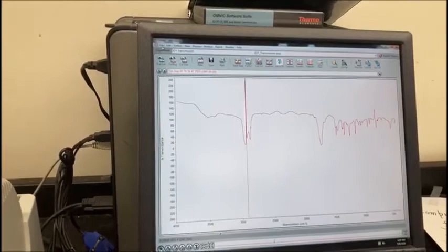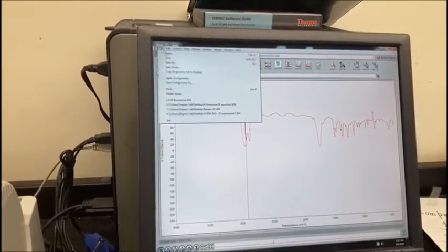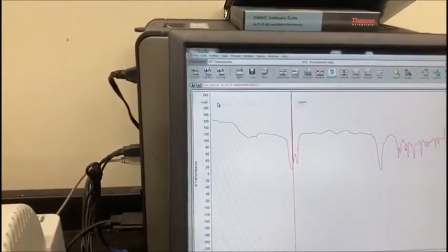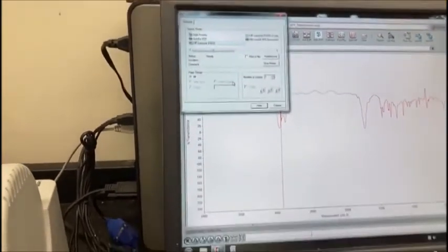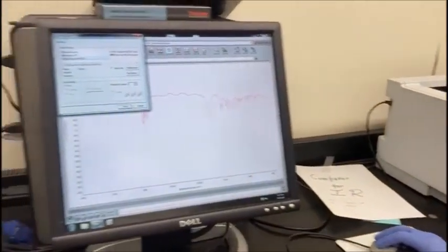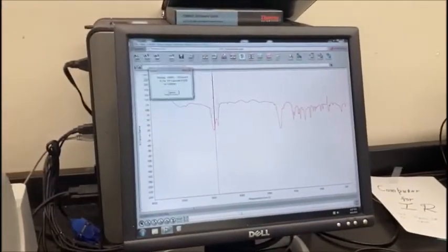To print your spectrum, you're just going to go to File and then Print. It should already be connected to this printer right here, and then you'll just click Print.